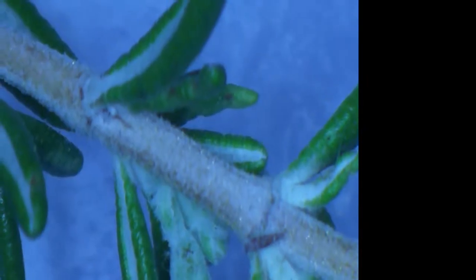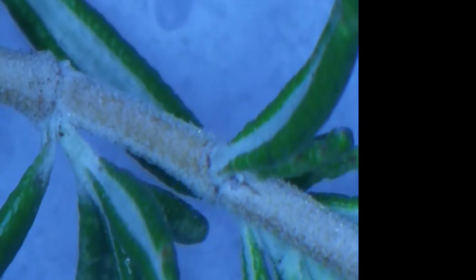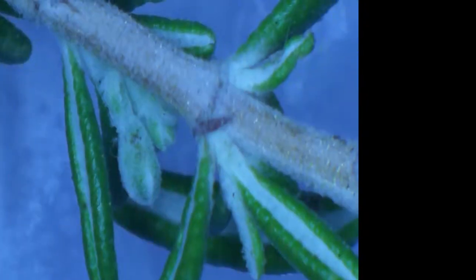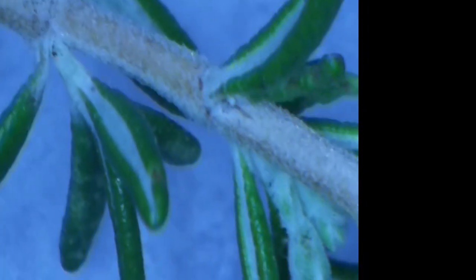There's the woolly bits there. They also have that kind of shiny crystalline look to them because of the glands in there for aromatic cells that produce aromatic compounds. And then there's a flower at the very top. Series of flowers.